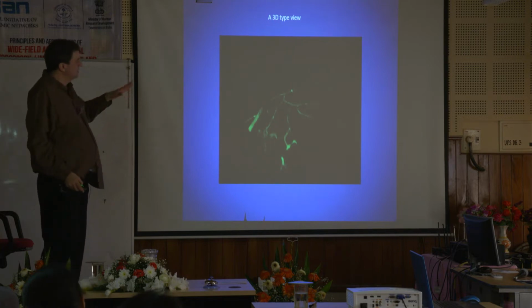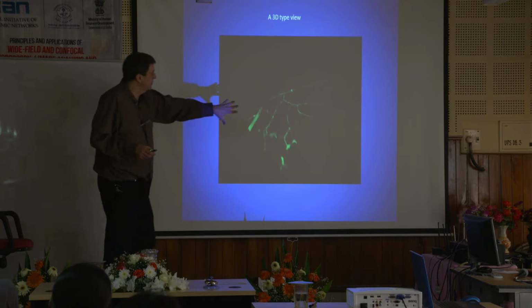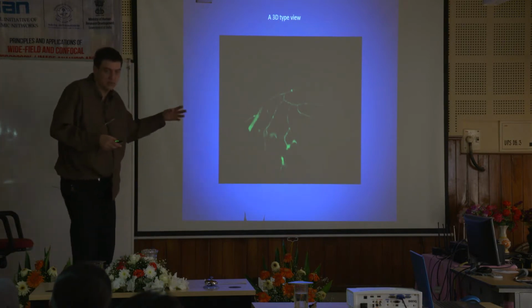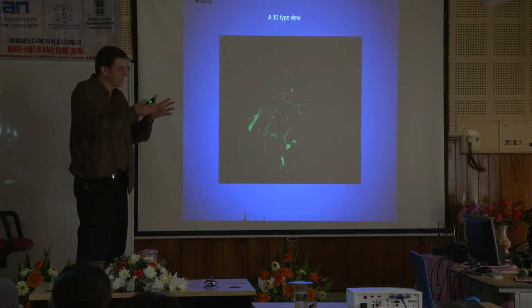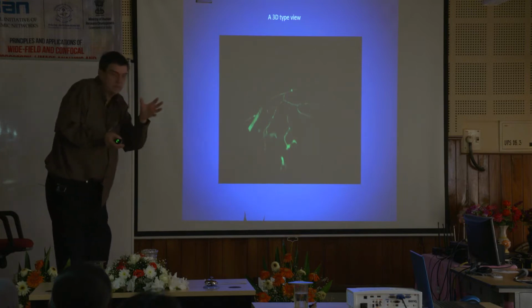You could also have taken that deck of cards and made it into a 3D rendering, and just take a single picture of that too. You can sort of see how these vessels come at you a little bit, or go away from you. So you can also make a single card that represents the 3D of it.